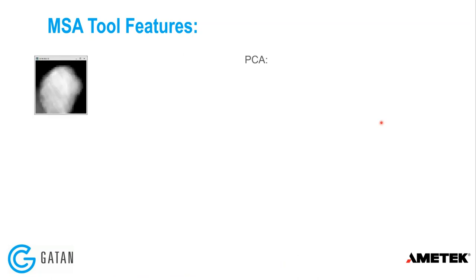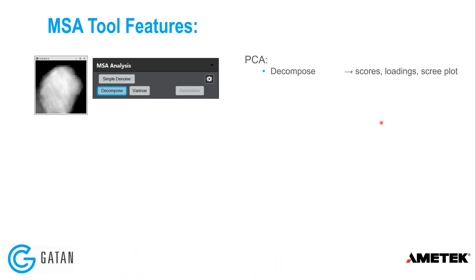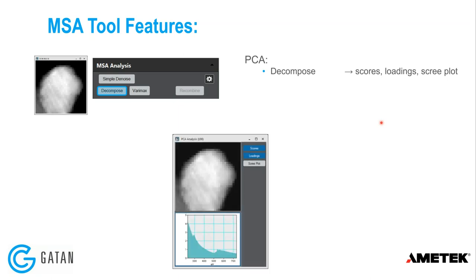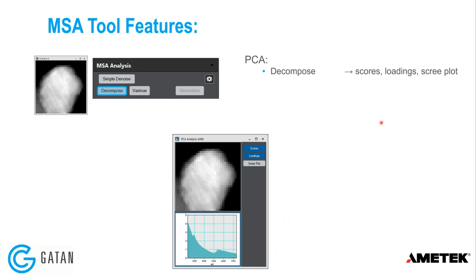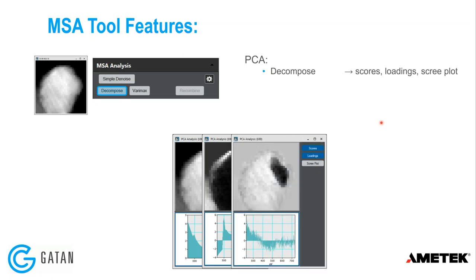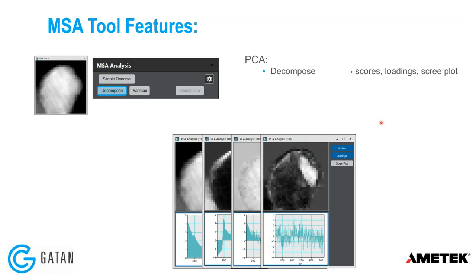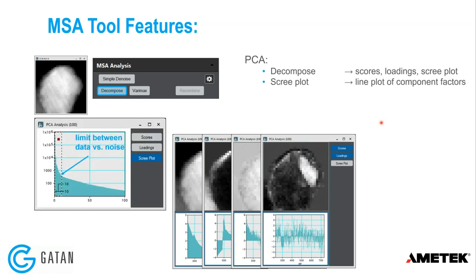So what are the features of the tool? We can do PCA, starting with the decomposition. There are four simple buttons; we start on decompose. Running a PCA decomposition gives us a dataset containing the scores, the loadings, and a scree plot. Here I'm cycling through the different PCA components of this dataset, in order of significance — one, two — and as we get to higher components, the variance is decreasing, which helps us interpret the data.